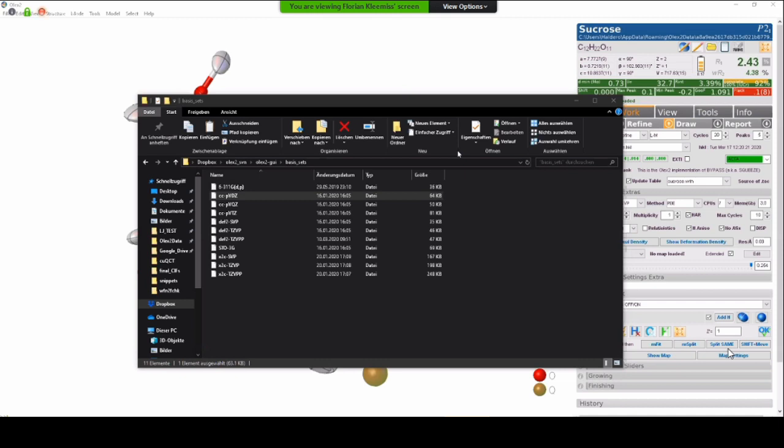So I would say as long as your model behaves reasonably, you can try to use the aspherical model. There have been tests that say you can do Hirshfeld atom refinement nicely with 0.8 angstrom resolution data.